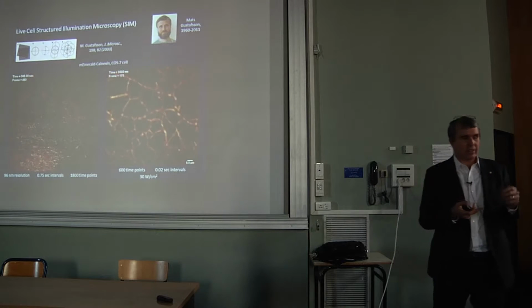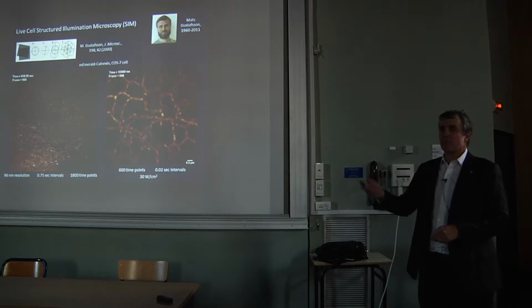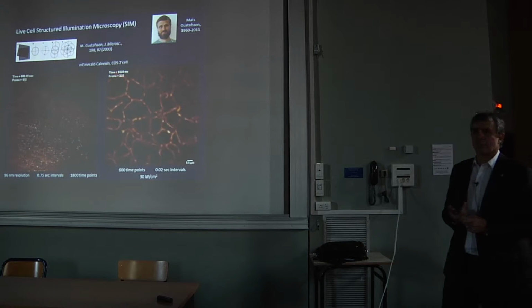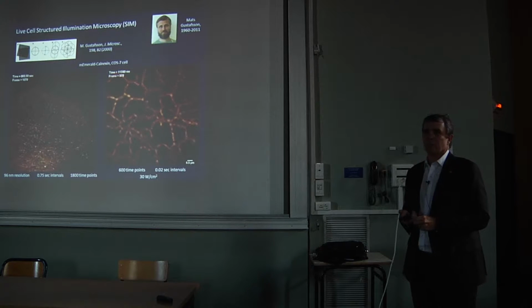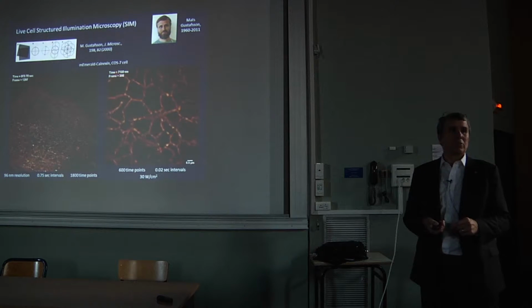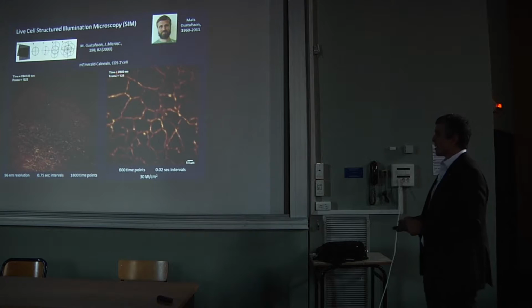Because A, you don't need to densely label the sample to the same degree as the other methods. B, it requires orders of magnitude less light. Life evolved at 1/10 of a watt per square centimeter. Localization microscopy requires a kilowatt per square centimeter. STED requires hundreds of megawatts to a gigawatt per square centimeter. So they're really not good tools for doing live cell imaging. SIM can get away with 1 to 10 watts per square centimeter, so it's much more in the ballpark of what life can tolerate. But it's also very fast, so it's easy to do sub-second acquisitions.